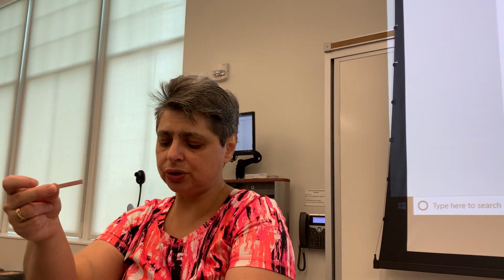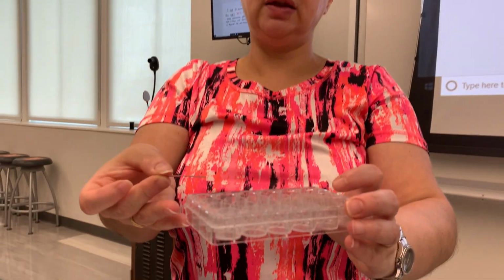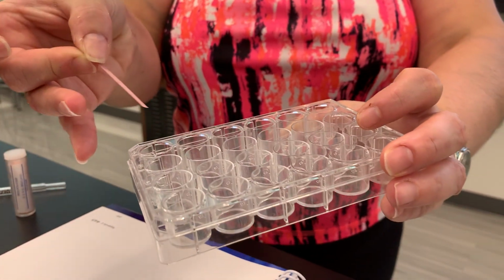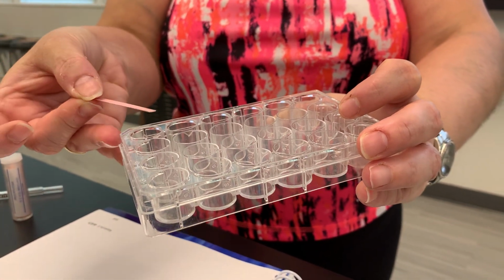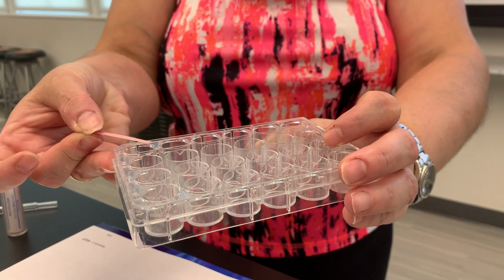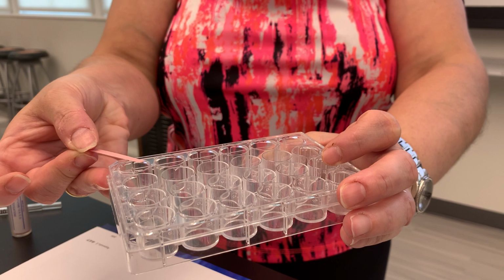So you're going to take a strip like this, and you're going to dribble a little bit of deionized water on it. This paper only works when it's wet. And then you're going to combine your two reactants. So first make sure you get litmus ready. Then combine the reactants, and then you're going to hold it like this, flush with the well. Do not dip it in liquid. Remember, you're trying to detect a gas, so dipping it in liquid is incorrect. It will not provide you with accurate information.